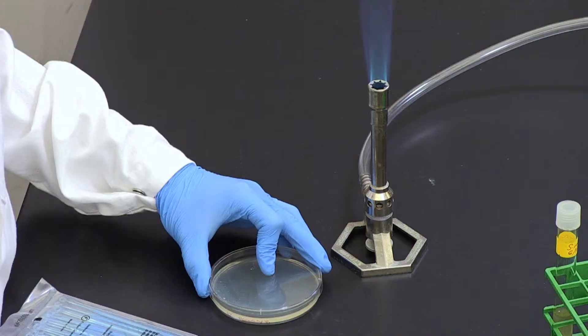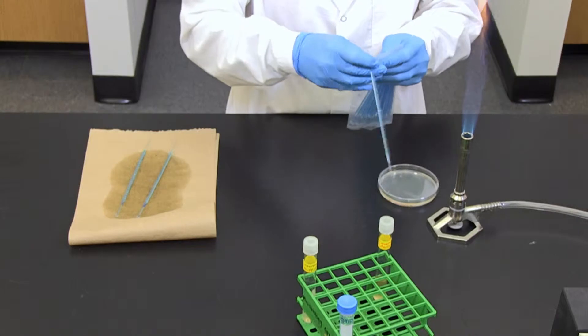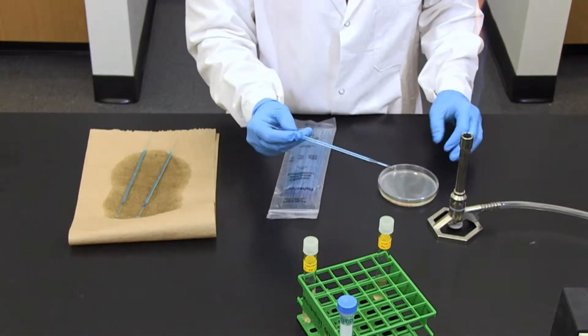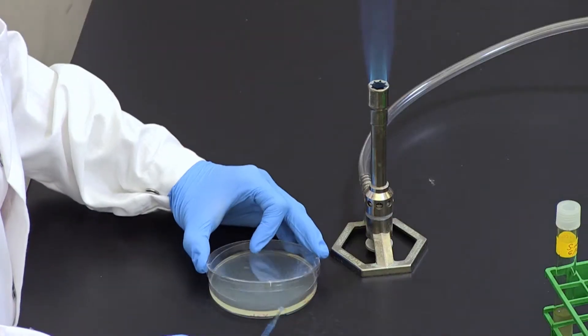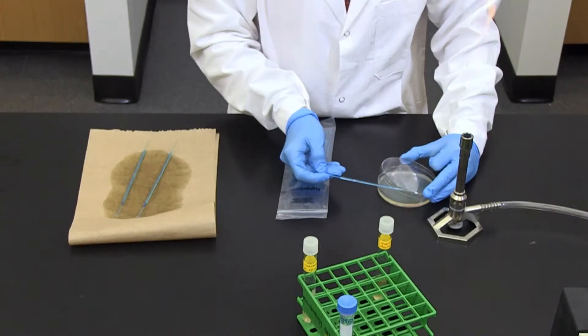Then, rotate the plate 90 degrees while keeping the plate closed, and streak area 2 several times back and forth with a sterile inoculating loop, hitting the first streak a few times.